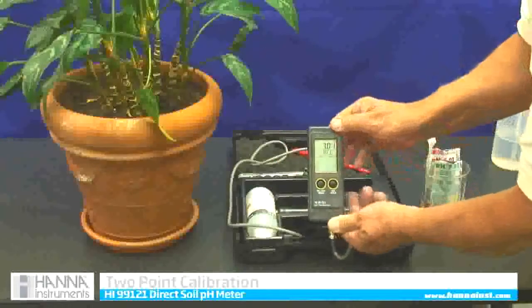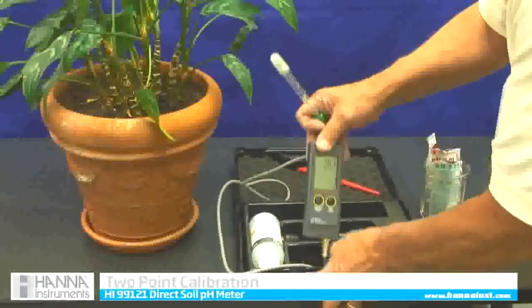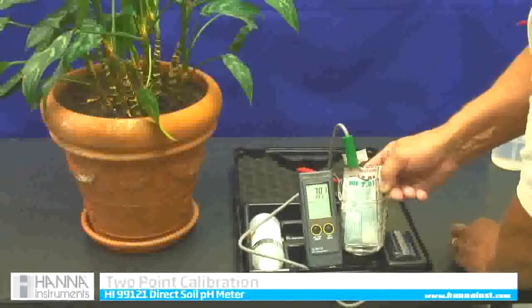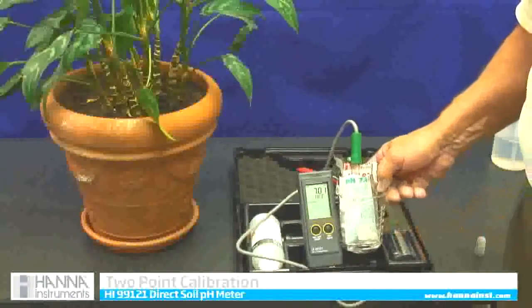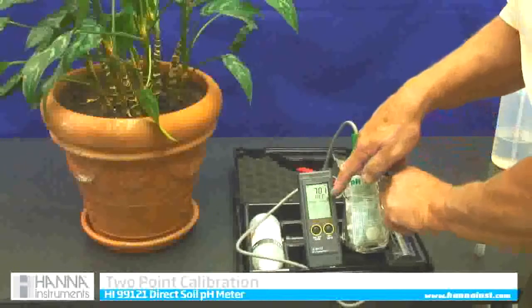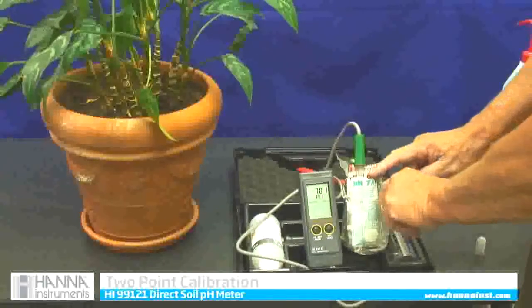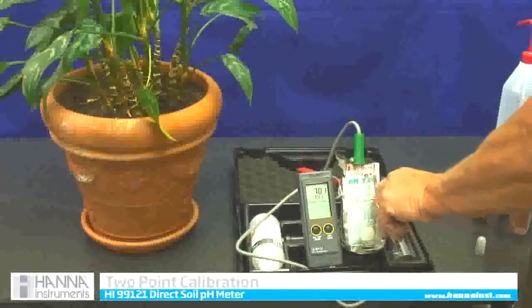Now I am going to do what it tells me to do. It says use 7.0, so I am going to put my meter into the 7.01 solution and swirl it around a little bit. The REC indicator means that it has recognized the 7.01. There is a flashing calibrated symbol on the lower right-hand corner of the screen, which means it is actually calibrating itself to this standard. This is a standard 7.01 solution and it is calibrating to that standard.